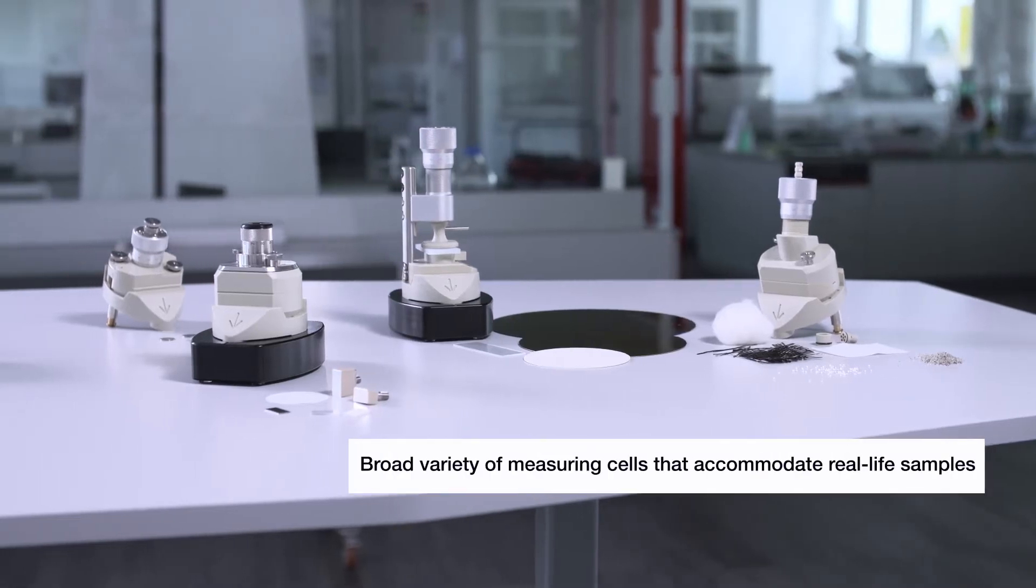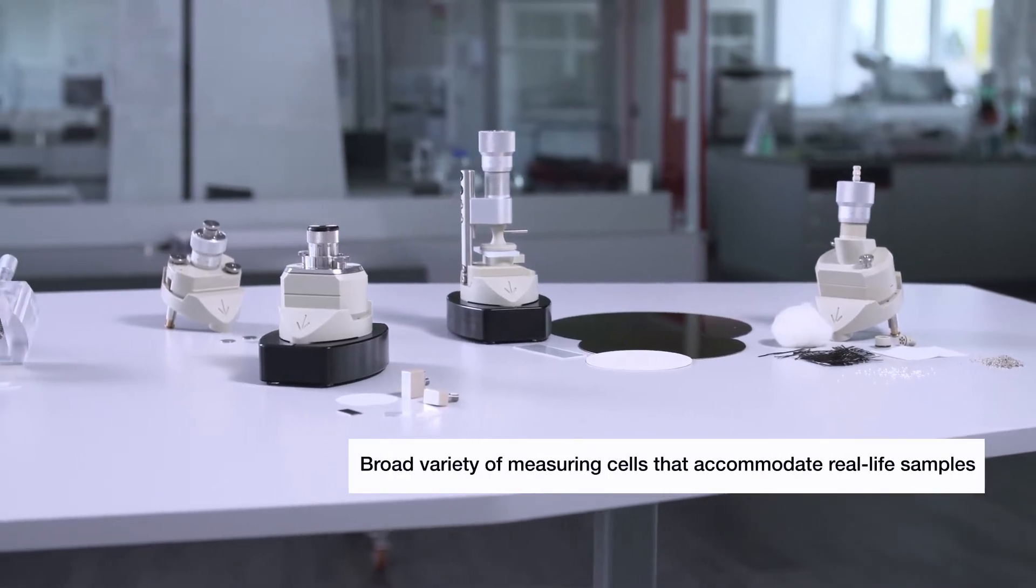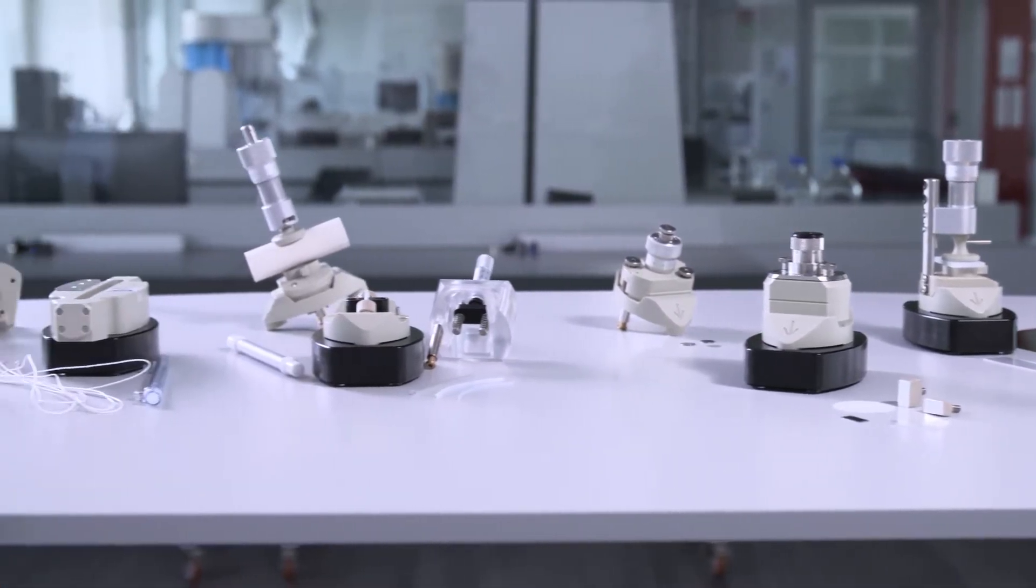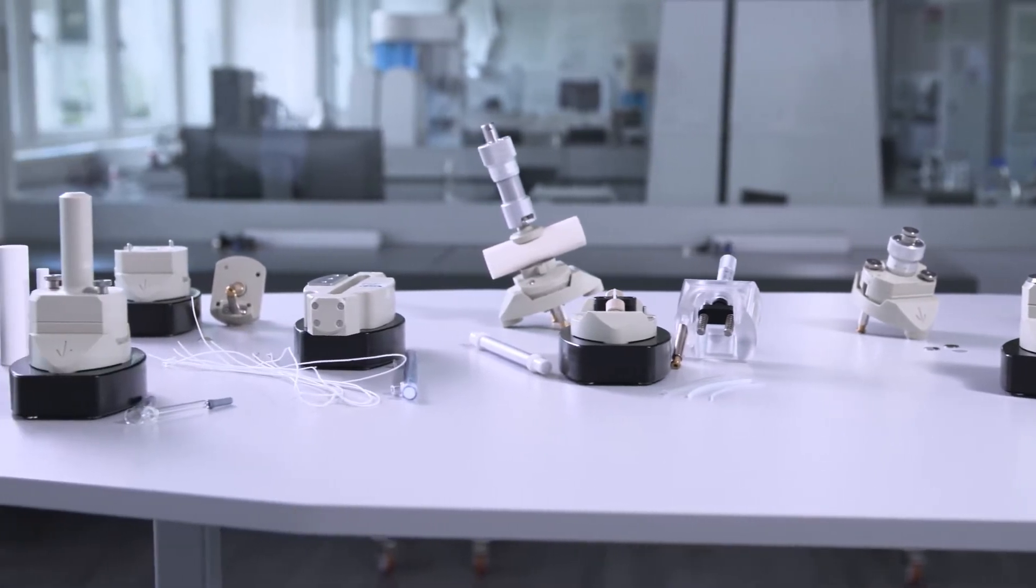Surpass 3 can be equipped with a broad variety of measuring cells that accommodate real-life samples, ranging from particles as small as 25 micrometers to macroscopic solid surfaces.